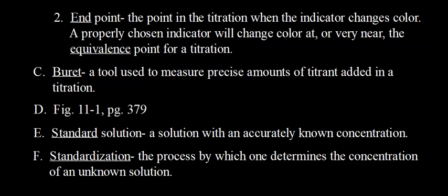So that would be 4.35 milliliters. So again, make sure that you can read any instrument to the correct precision. So in this one, again, it's hard to tell in the picture. I'd have to see that burette in real life. Either 5.35. Better yet, because those lines are so close together, I'm going to go with 5.4 milliliters. So again, it's not how much is in there, it's the level that we record.